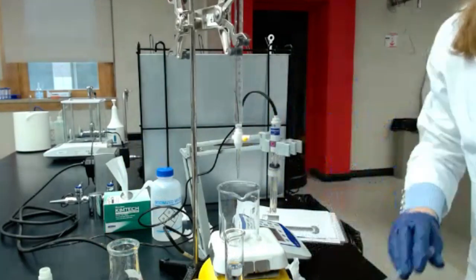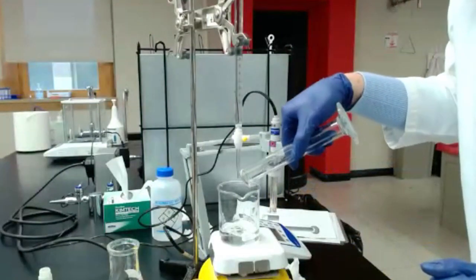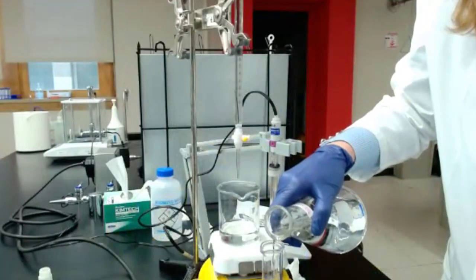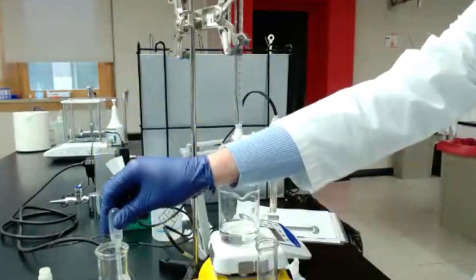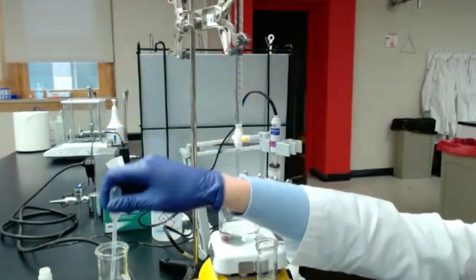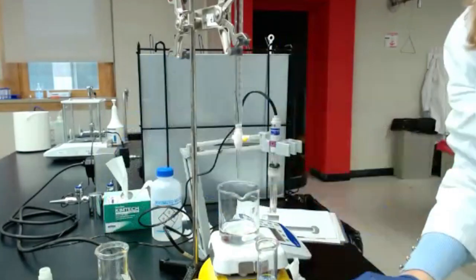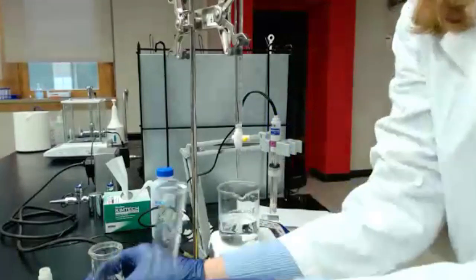All right, I've got 50, sorry. I'm doing it twice, so I'm just transferring, making sure I have 100 milliliters of water in that beaker. All right. I've got 100.